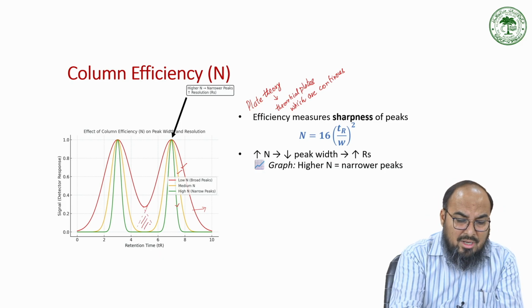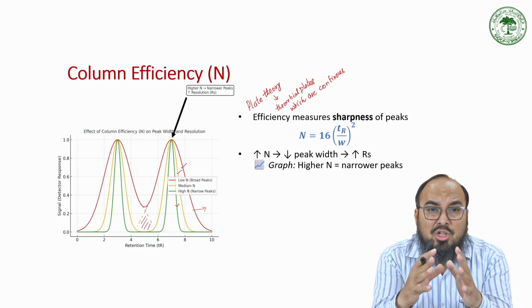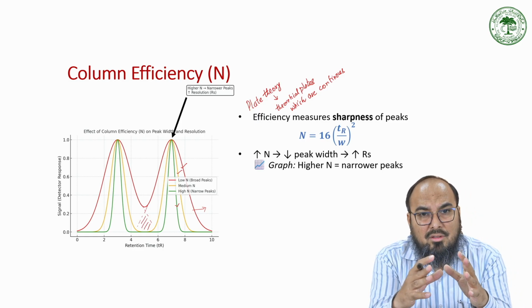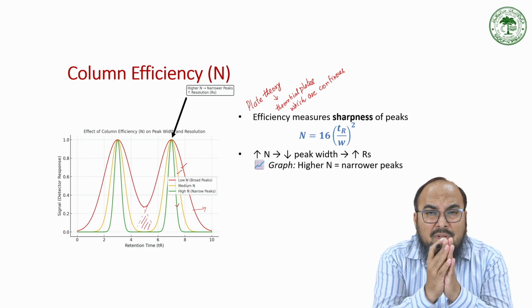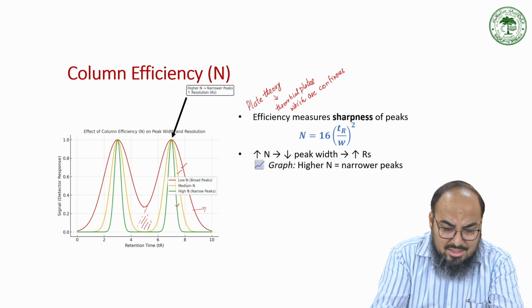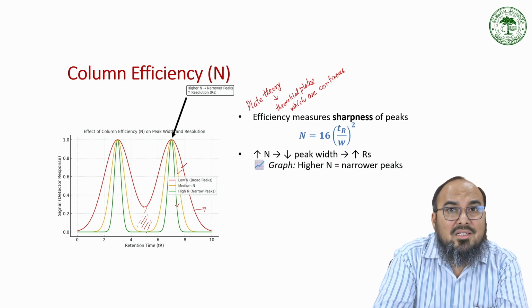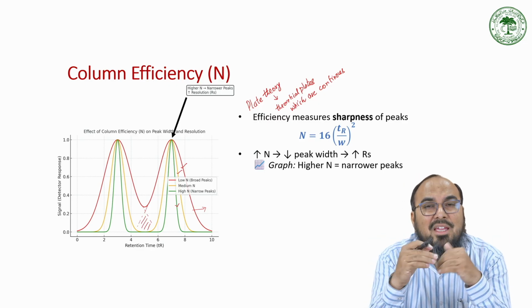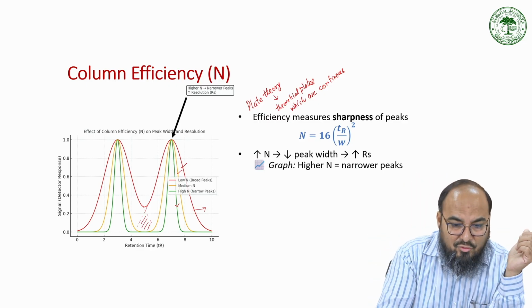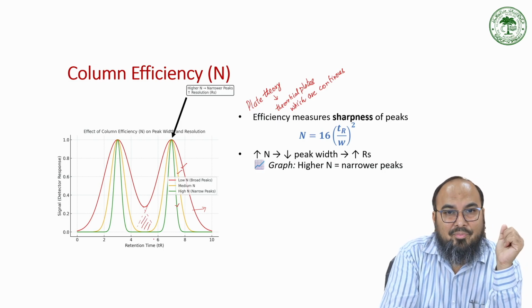So this common area is actually restricting your quantification of the two components. In order to have a good quantitative idea, your peaks must be well separated. You can see that the yellow and green peaks are well separated. They are actually touching the baseline. You can see that you have a baseline separation in B and C. So for an effective separation, you must have a baseline separation.